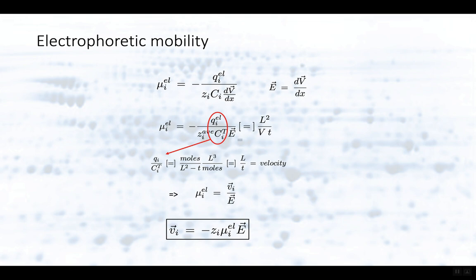Believe it or not, you can measure how long it takes an ion to move from a starting position to a final resting position. As long as you can see or identify the ion, you do it as a bolus at one end, you pick it up as a bolus at the other end, and that gives you an idea of the velocity. If it traverses a distance L over a given time, that's the velocity. So it's a measurable quantity.